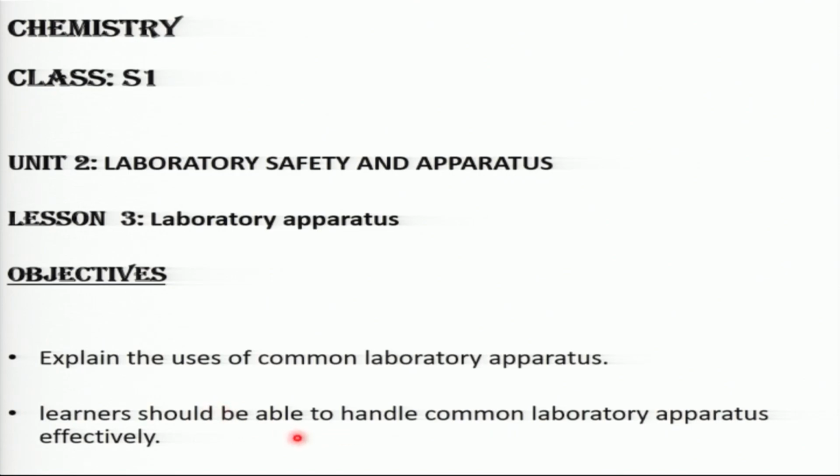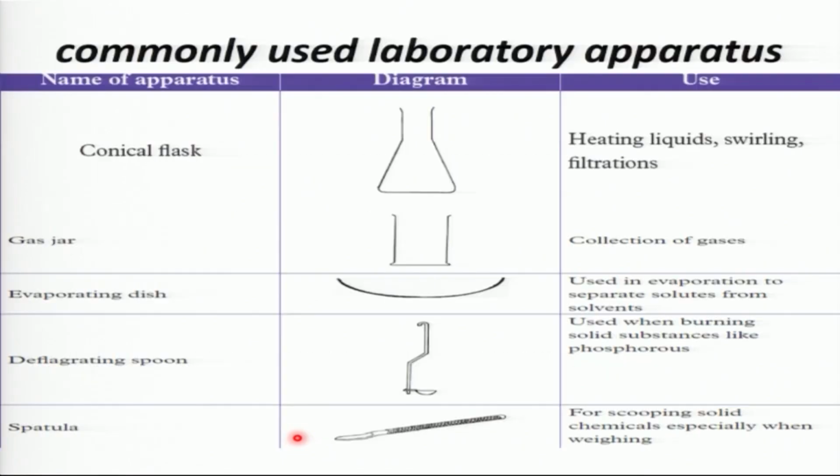You see, if you're going to boil something and you use your hand, you find that it burns you, and at the end of the day, you break the test tube. So the test tube, when it is hot, needs to be handled with precautions, right? So that you don't pour it down.